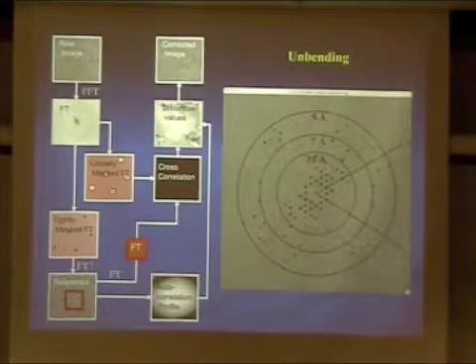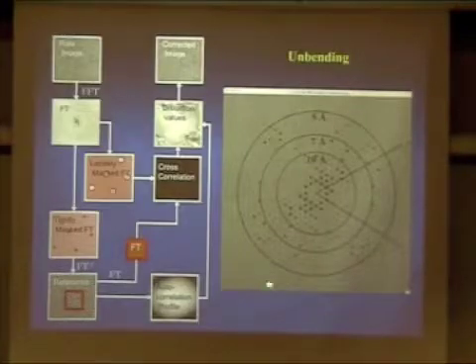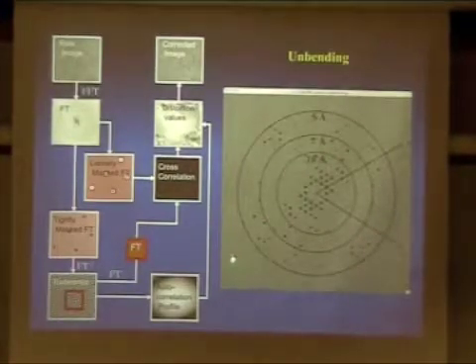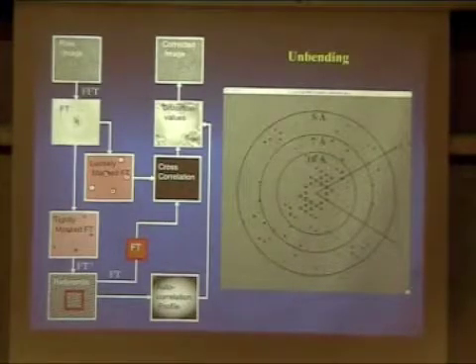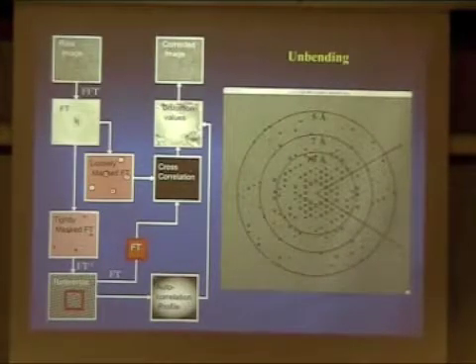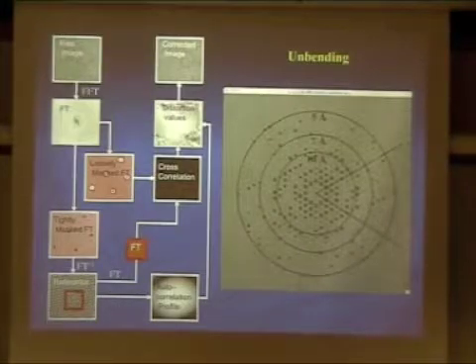So here's the example, and also the basic flowchart. The purpose of this is, say you have an image, and in this case you can see some diffuse spots in a certain area. They're not even showing up when you use the image box to extract the FT space, because they are too diffuse. So the purpose of unbending is to make those become sharp enough so that when you extract, you can get the information out.